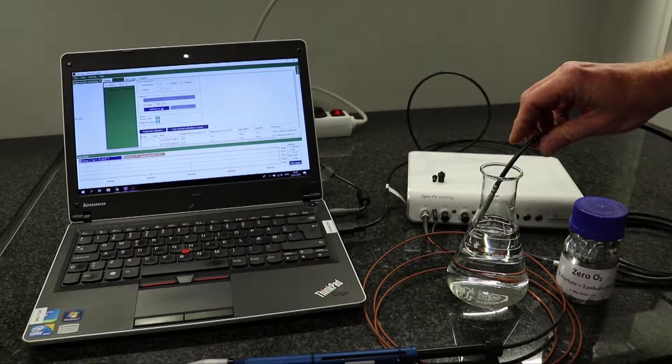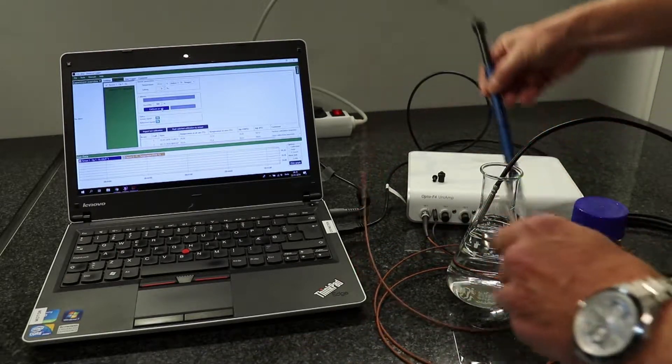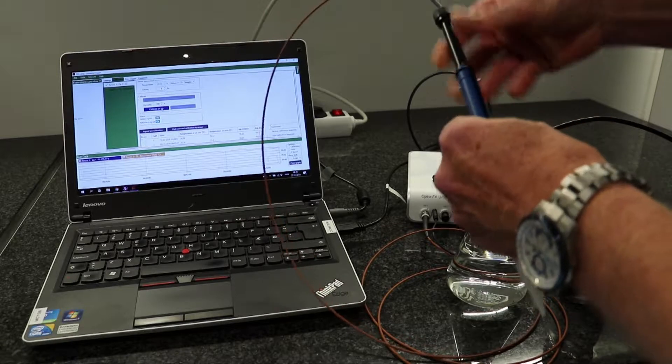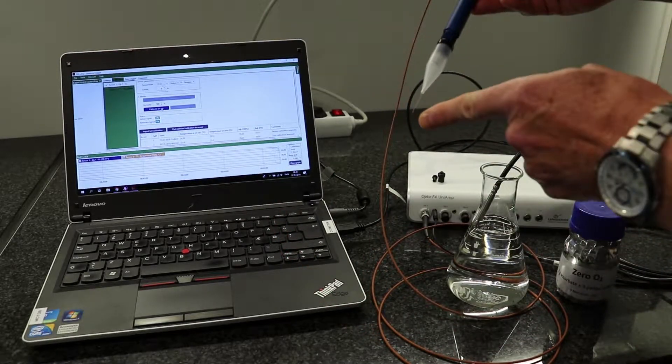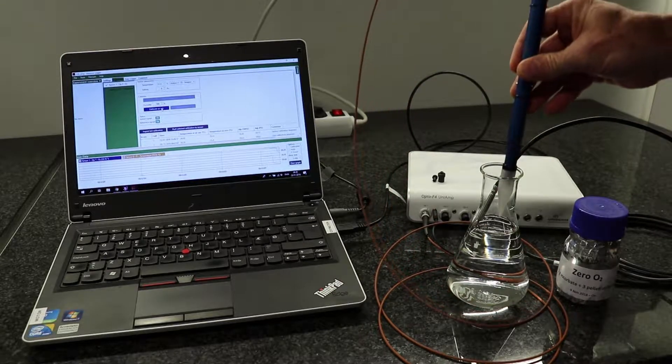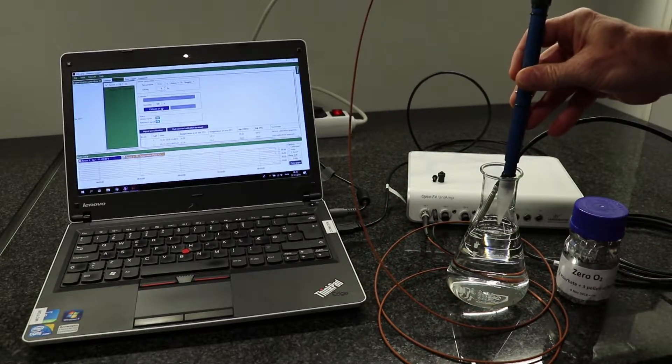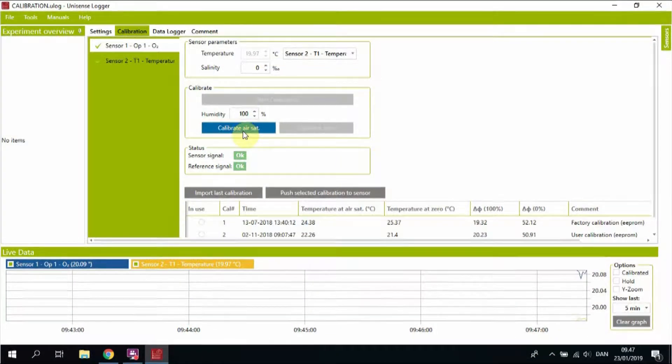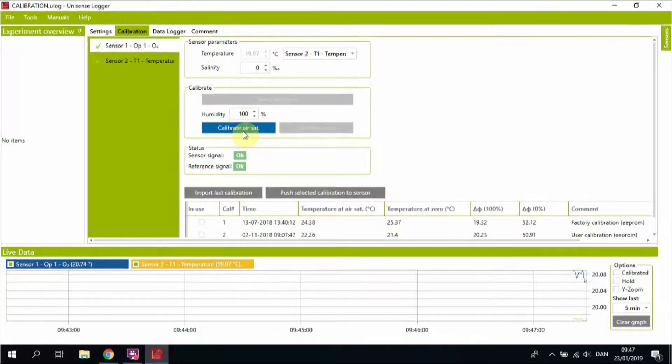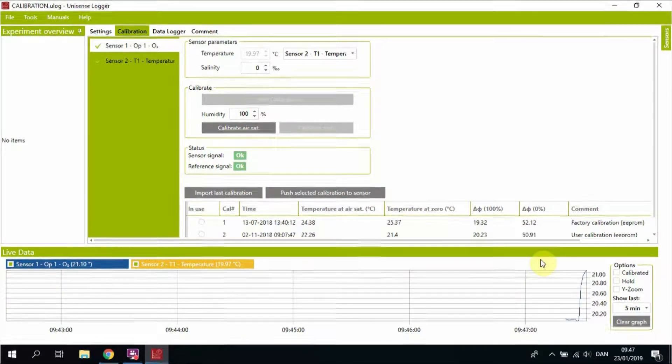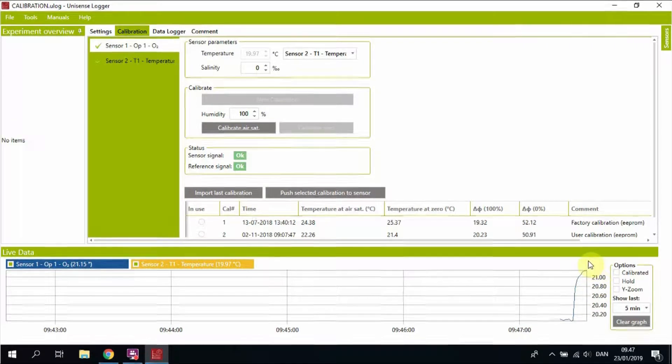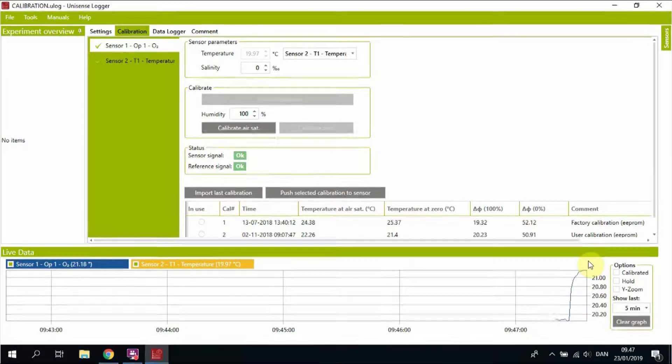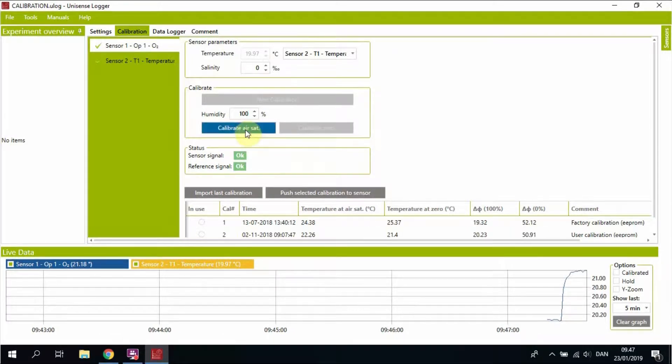Insert the temperature sensor into the aerated water. Expose the fiber. It is flashing with an orange color. Position it into the aerated water and press calibrate once the signal is stable. Look at the live window below and don't press calibrate air saturation before you have a stable signal.